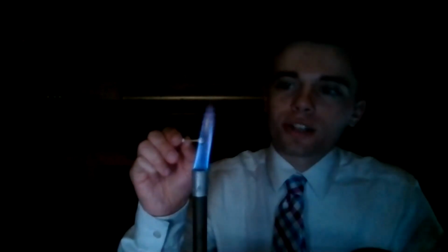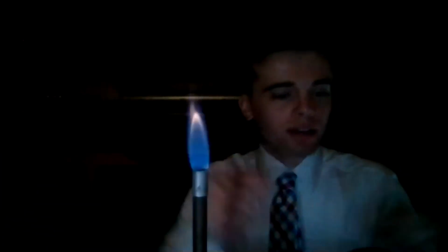It's kind of that darker orange color. Oh, there we go. It's red. I don't know if I call that red. Maybe a red-orange. I guess on camera it does look pretty red, though. It's popping over here.